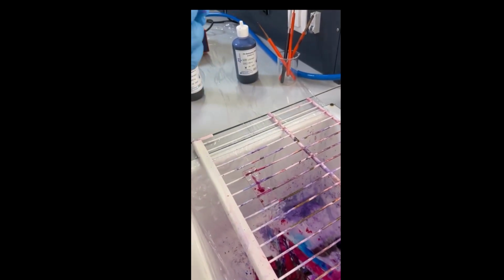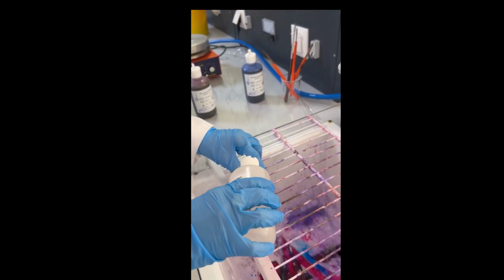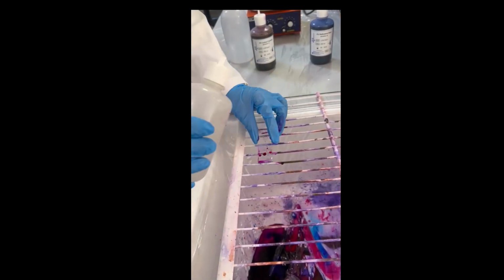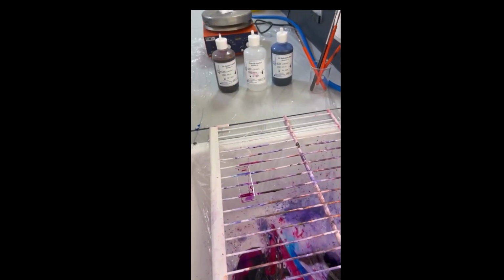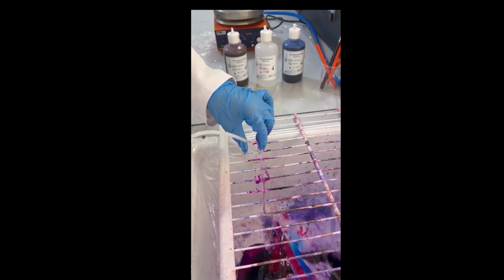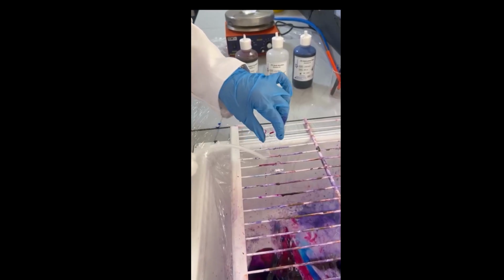The next step is to add the acid alcohol drop by drop for about 30 seconds. This will remove the red color from all non-acid-fast bacteria, while the acid-fast bacteria will retain the primary stain. I wash until the color disappears.